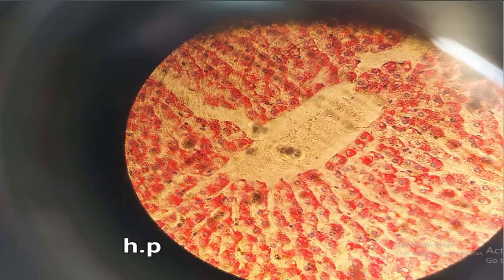One important question which you can be asked in the exam is what fixative or chemical was used to fix this slide. The chemical used to fix this slide is a special fixative, which is Carnoy's. Carnoy's was used to preserve the glycogen granules in the liver, so that we'll be able to stain them using PAS.